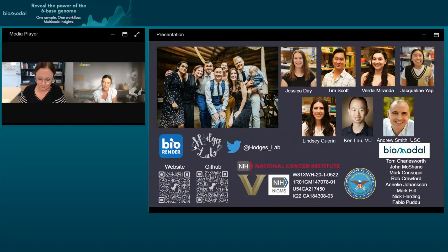Absolutely. And Emily, I had this question come in a few different variations, so I do want to squeeze it in for our on-demand viewers. Do single nucleotide variants, SNVs, in enhancer or promoter regions have any effect on MC or HMC profiling? I would say certainly they can. I know that it's not something that we ourselves have done, but this method allows you to distinguish variants and also look at methylation in both states of methylation. So it's possible that you can see those things.